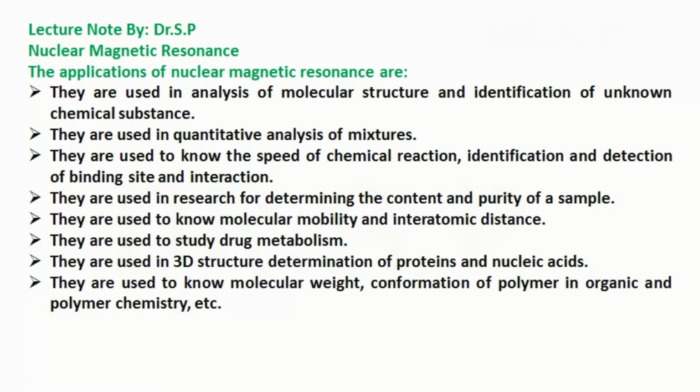They are used to study drug metabolism. They are used in 3D structure determination of proteins and nucleic acids. And they are used to know molecular weight and conformation of polymers in organic and polymer chemistry, etc.